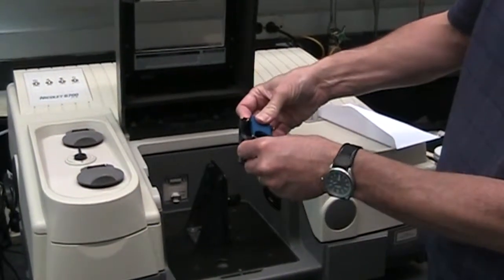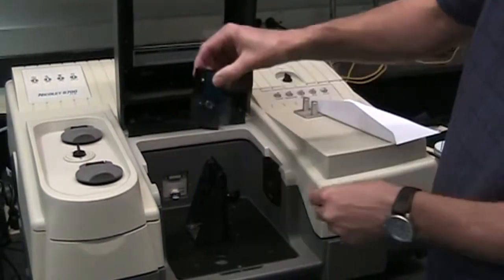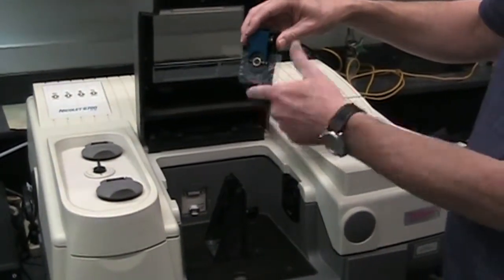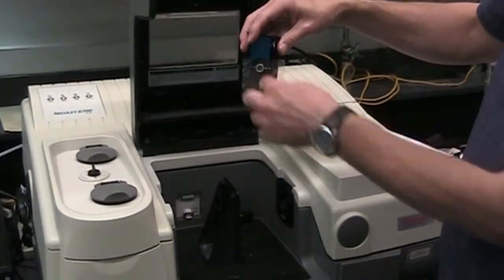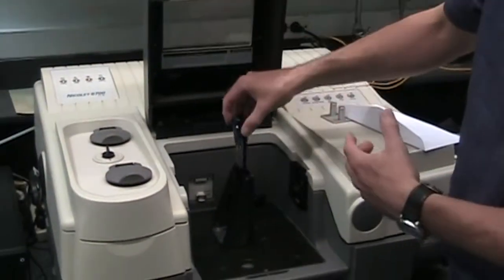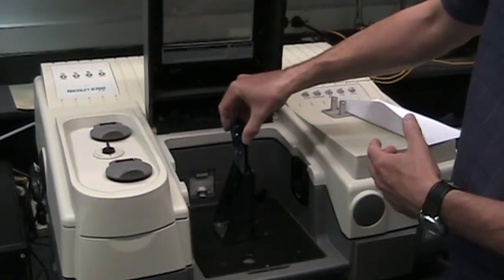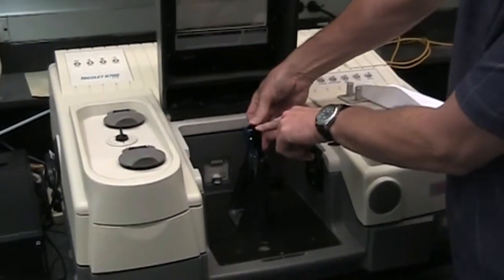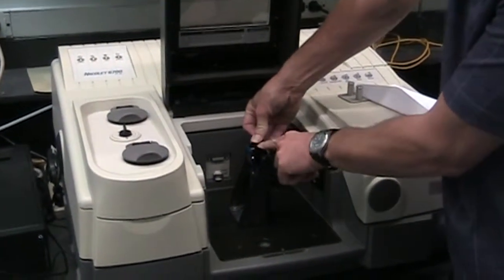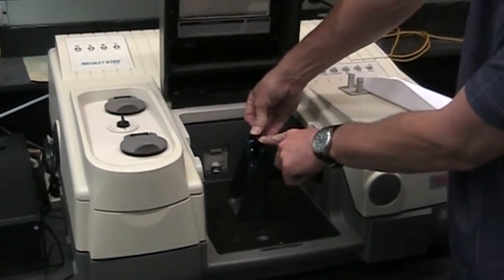But basically, it just goes in, and then the spring action sort of holds it in position, and that's where the sample is going to be. So that's kind of your sample. This slides in. It's a little tight, so it takes a little bit of muscle, but not too bad. You push this down. You want to push it all the way down, then you're in position.